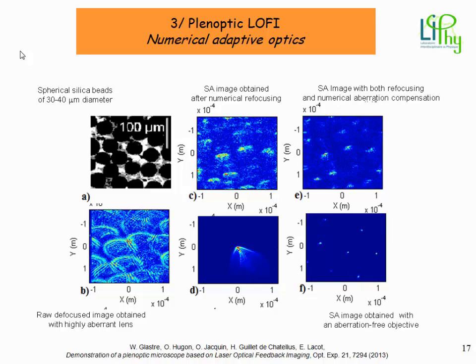And finally, the image D shows the initial PSF, which illustrates the aberrations initially present in the objective, which we numerically corrected from this image to this one.